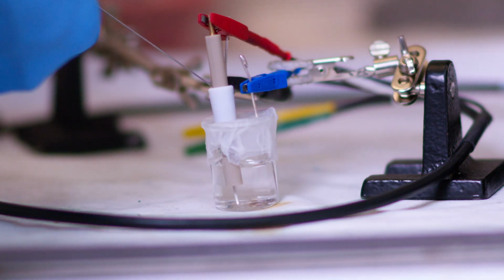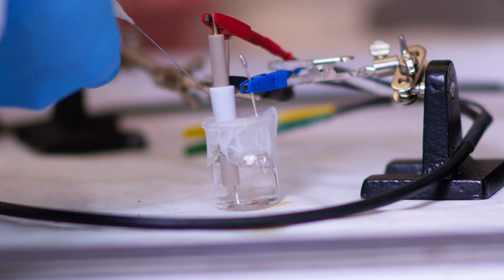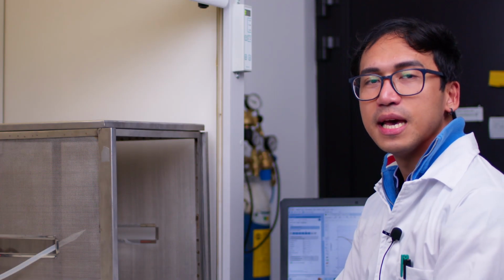Now in our case, as you can see in our Faraday cage, what we'll try to do is to degas our solution with argon and then cover our cell, leaving a blanket of argon in there as well, just to make sure that we are preventing the presence of oxygen in our system. And then we'll do another cyclic voltammetry to see the effect of removing the oxygen.